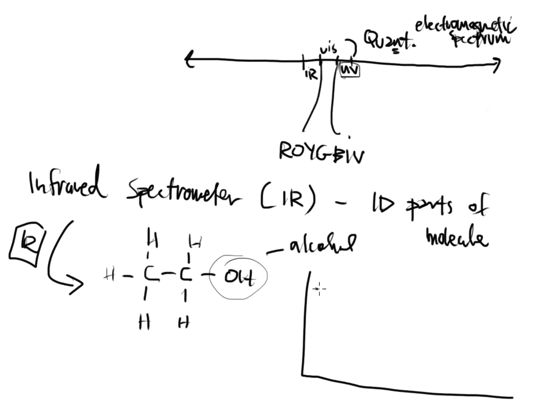And that workout routine is shown on a graph in the infrared spectrometer. And if an OH is present, then that particular type of shape will show up every single time. Well, the other groups on molecules, they all do their own thing.